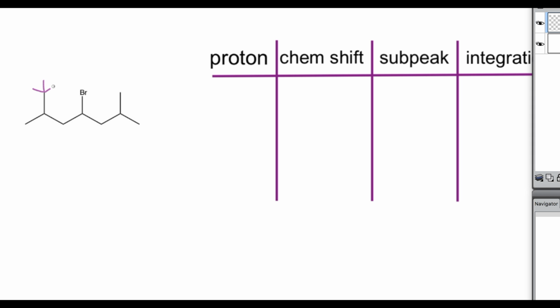Here are more example problems about NMR. From this video, you should be able to identify chemically inequivalent proton environments and piece your NMR structures together. Near the end of the video, there will be some IR spectroscopy tips in identifying certain types of functional groups. In this example, we're given a molecule without the hydrogens drawn in.